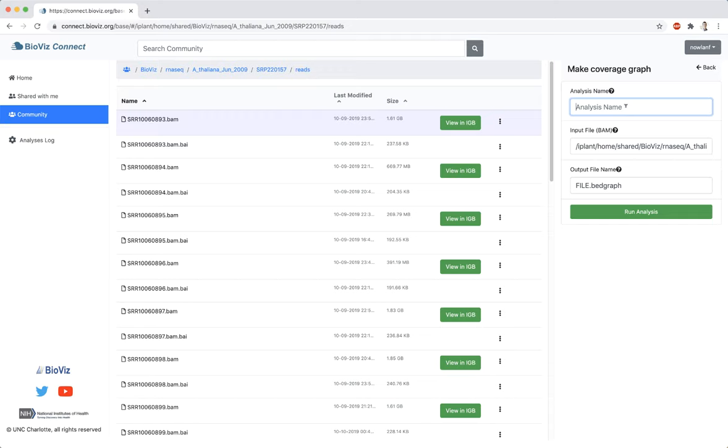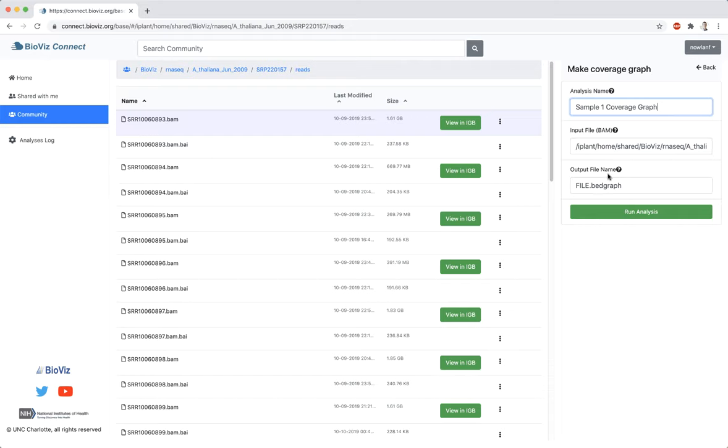Enter a name for the analysis. This will help keep track of its progress. The input file has been pre-selected based on the file I chose. I will change the default output file name to match the file name.